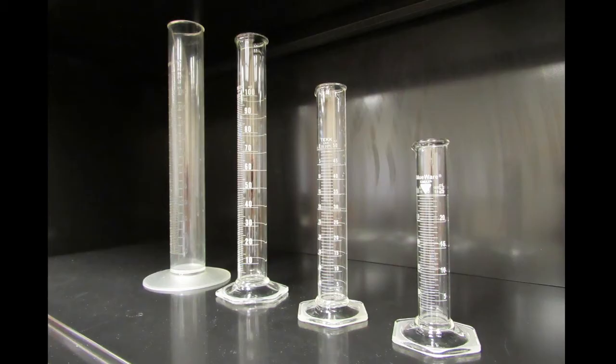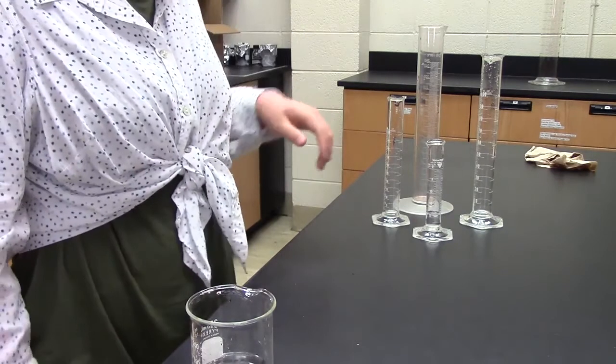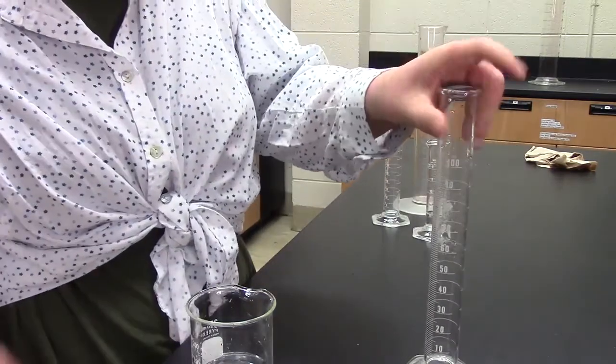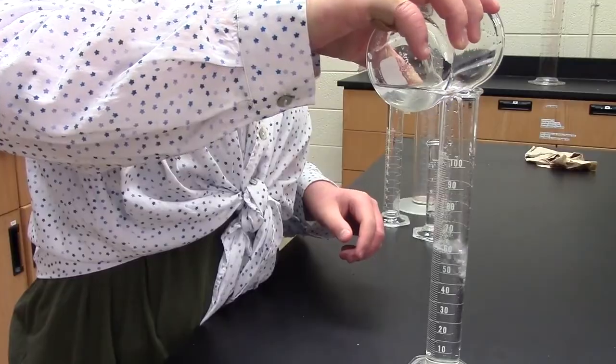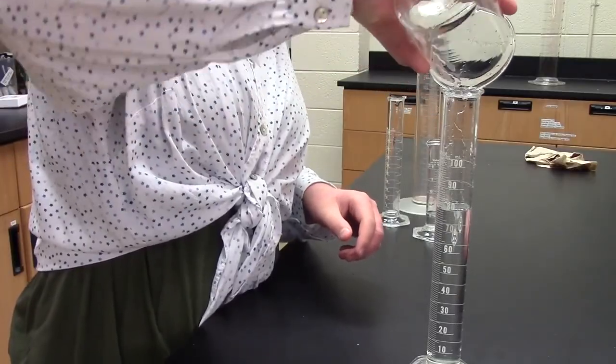There are many different sizes of graduated cylinders, from this little one all the way up to this giant one. Be sure to choose one that will hold all of your solution in one go, but not one with a capacity far beyond what you actually need. For example, if I need to measure 80 mL, I'll choose a 100 mL graduated cylinder, and if I need to measure 800 mL, I'll choose a 1000 mL graduated cylinder.